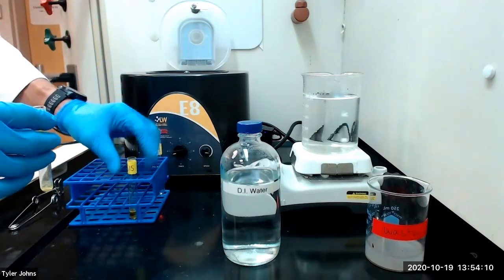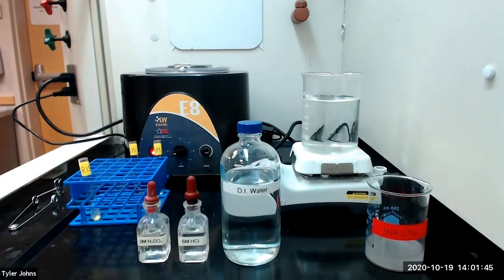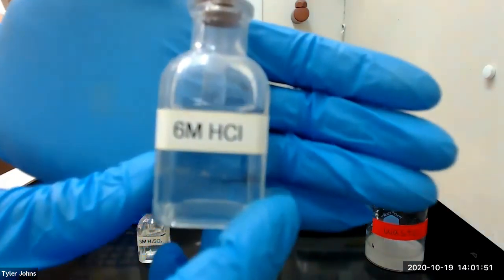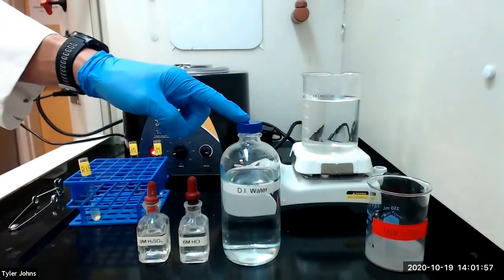We will relabel our precipitate of barium chromate as R15. We will next dissolve the yellow precipitate R15 with two to three drops of six molar hydrochloric acid, then dilute to two milliliters with deionized water.